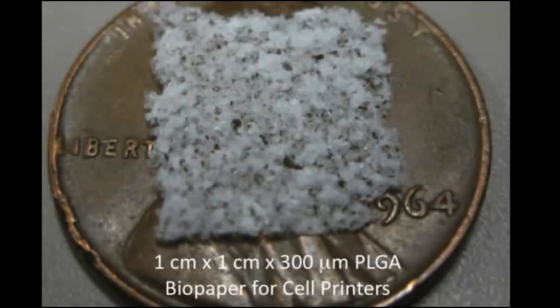Our manuscript is the first to describe research that demonstrates the use of thin, biodegradable polymer sheets as viable substrates for cell printing. We believe that biopapers like these will facilitate tissue and organ printing from the bottom up by creating prevascularized constructs layer by layer.